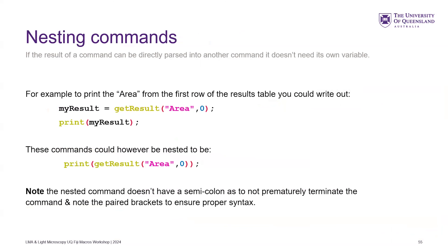We can nest commands. What I mean is if the result of a command can be directly passed into another command, it doesn't need to be defined as a variable. So we could have `my_result = getResult('Area', 0)` — that goes to the results table, looks at the column Area, and gets the first row value — then print that result. Or you could just say print the result of Area on the first row in a single line. This is good and technically runs slightly faster, which adds up over a hundred lines of code run a hundred times. One thing to note: you don't put a semicolon inside when you're trying to resolve this.